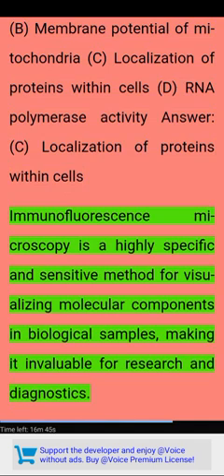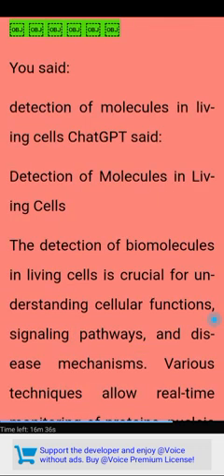Immunofluorescence microscopy is a highly specific and sensitive method for visualizing molecular components in biological samples, making it invaluable for research and diagnostics.